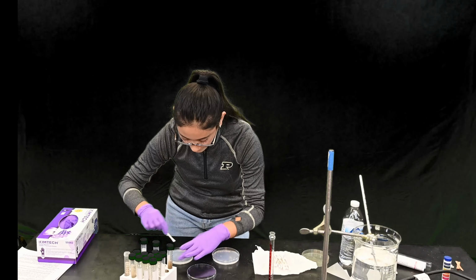Now you are done with plating. Now that you are done plating, you are going to place these plates in a warm, dark room for about 7 days.